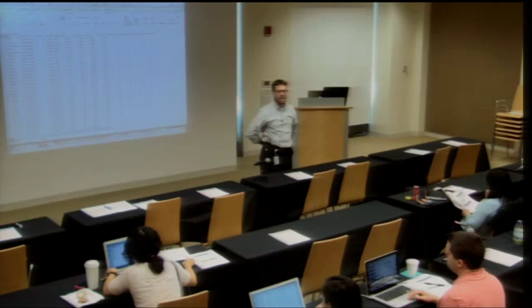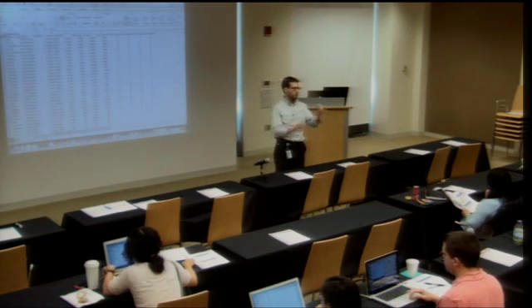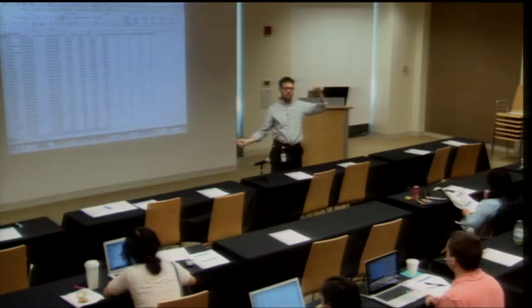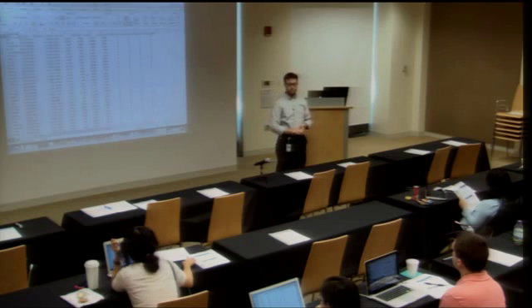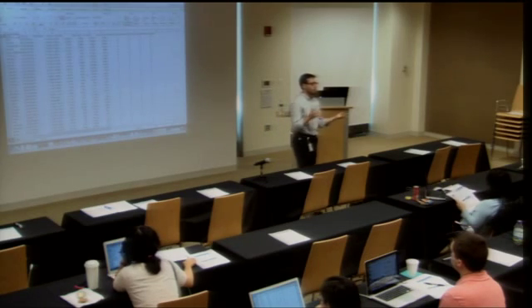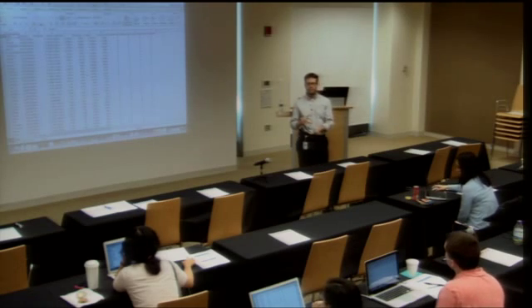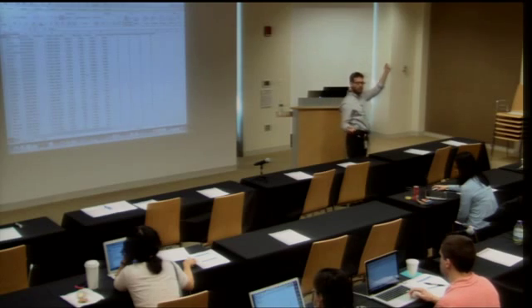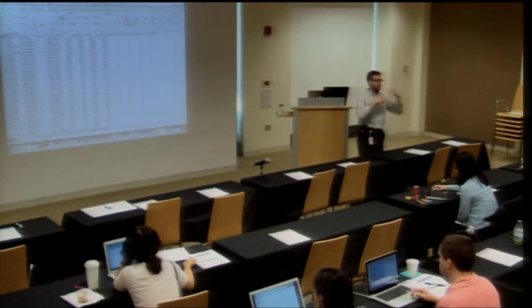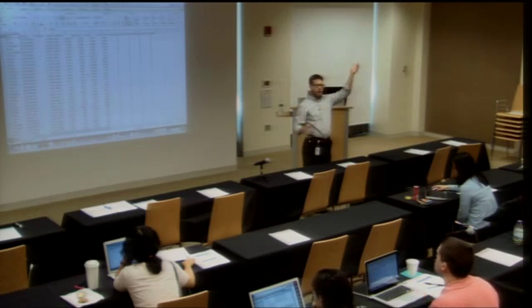What's a hit and what's not a hit? No, so RIGER does not do that. It's assuming that you've got a continuous list of scores and that all throughout that distribution, the numbers are meaningful, right? Which we know isn't always going to be true, but that's the sort of thing that is going to be specific for your screen. And some screens, probably it is relatively meaningful. The amount of change in the abundance of a hairpin is meaningful from top to bottom of the list.